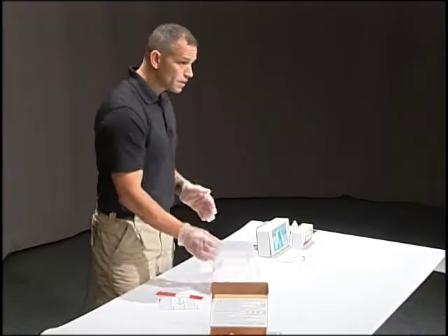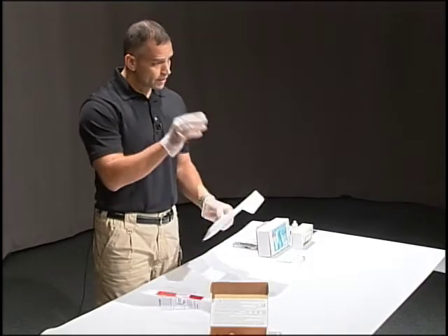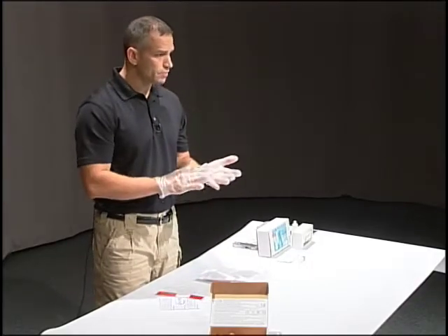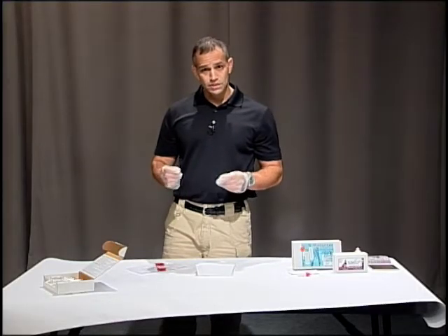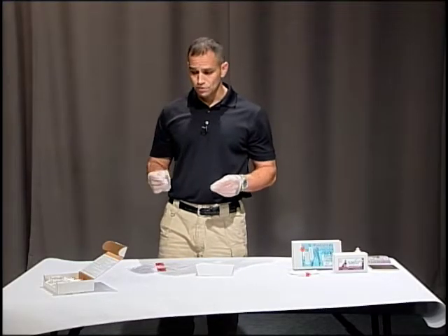What we're testing for is what happens when the gun goes off — that plume is going to contain lead, barium, and antimony. That's what they're going to be able to test at the lab when they scan it electronically.